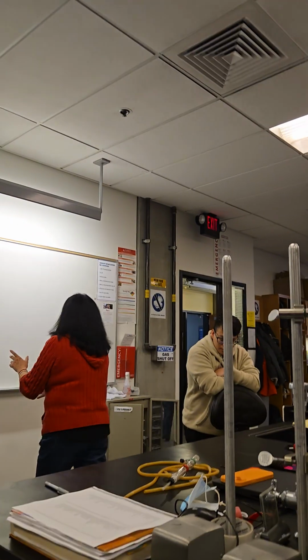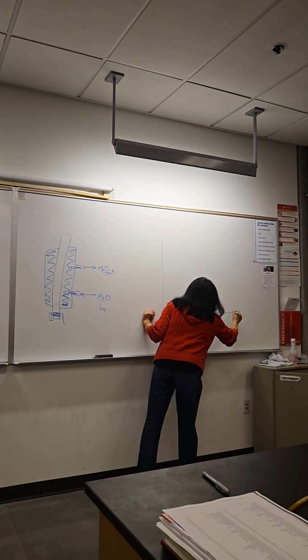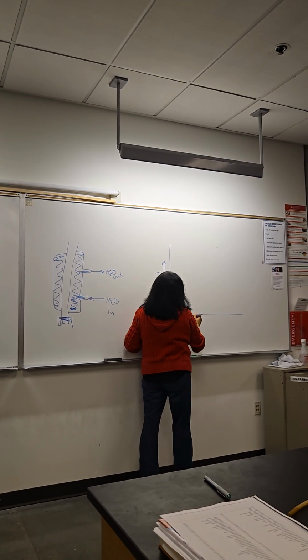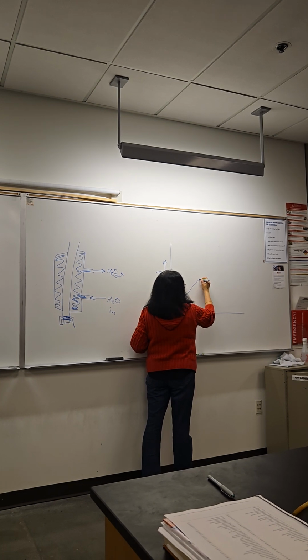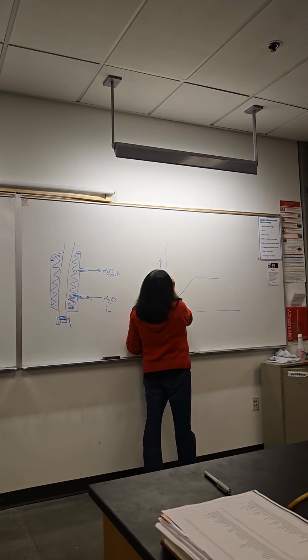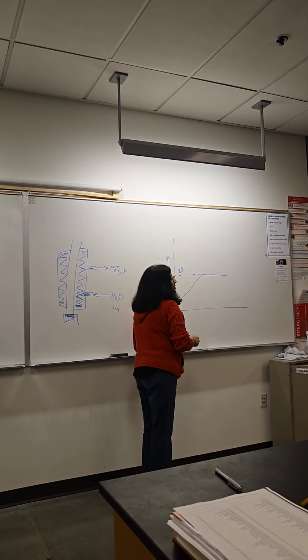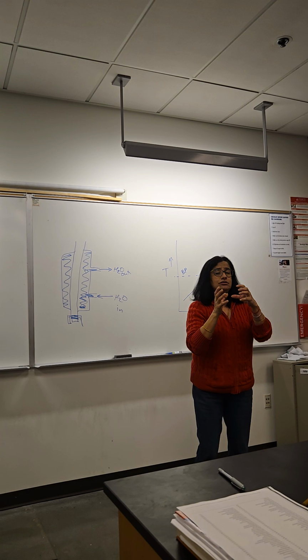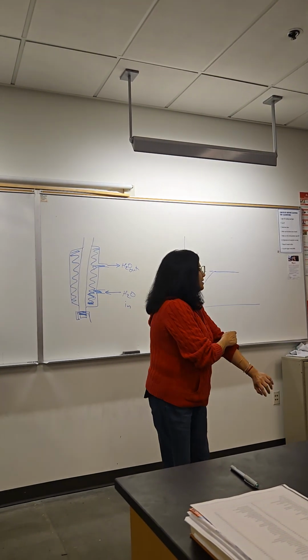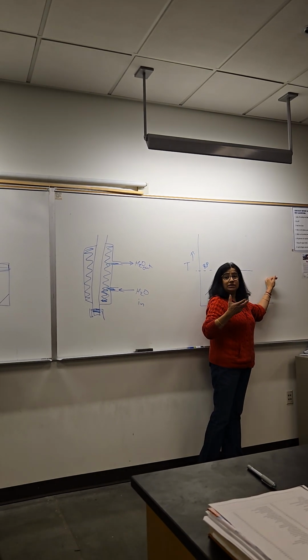Practically speaking, if everything goes as expected, you're heating the liquid, and then you will probably see a plateau. The temperature is the moving thing. Because if you remember from Gen Chem, when a phase changes, when a solid becomes a liquid or a liquid becomes a gas or vice versa, the temperature becomes constant because that added energy is becoming what?